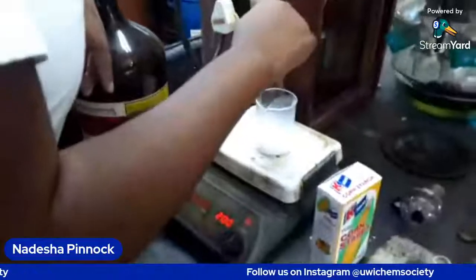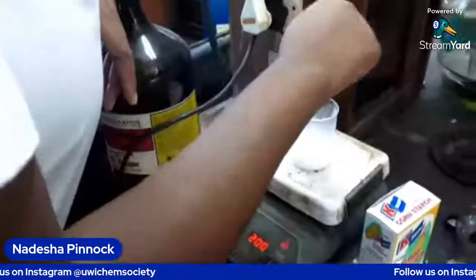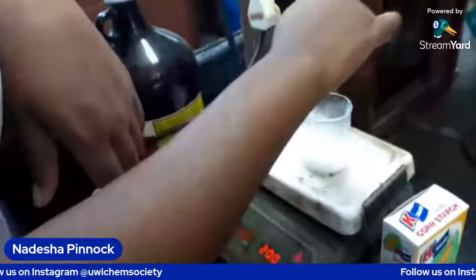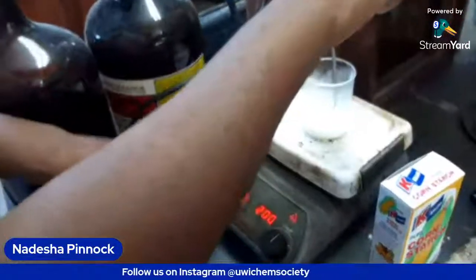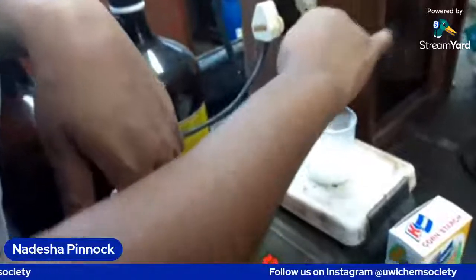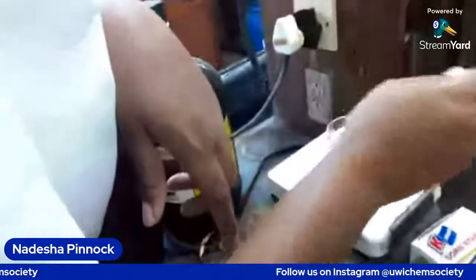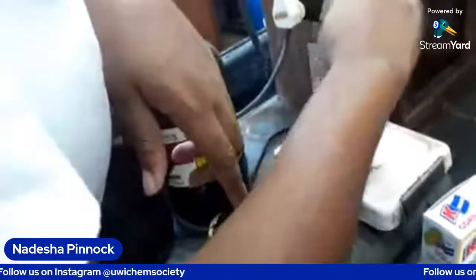All right, so guys, we are at the, I can never remember what this thing's name. Hot plate. And it's also a stirrer, but for it to be a stirrer, we need a magnet. Yeah, a magnet. So you have to add it inside the solution and then turn on the stirrer. So it's a magnetic stirrer. You'd have to add something magnetic into the solution. Right now the solution looks liquidy, so to say. It takes a couple of minutes, not a long time, to thicken.